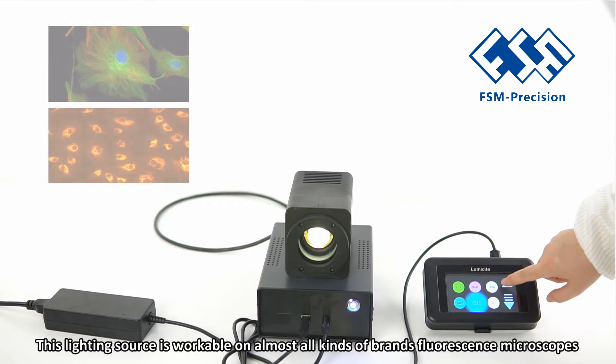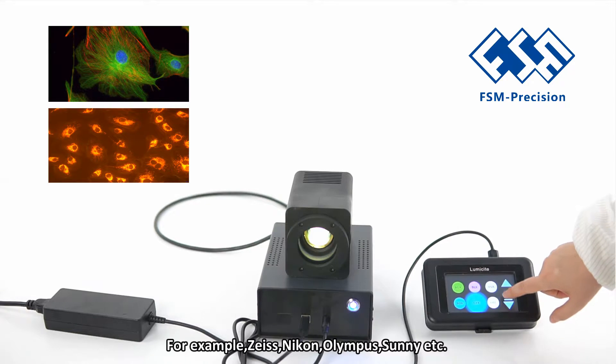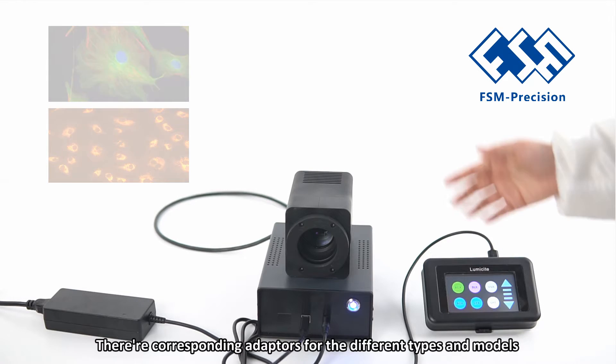This lighting source is workable on almost all kinds of brand fluorescence microscopes. For example, Zeiss, Nikon, Olympus, and Leica. There are corresponding adapters for different types and models.